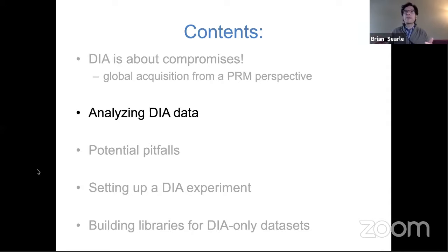And the reason why is because when you're co-fragmenting peptides in a small range, so for example, from 500 to 525, you only have to worry about peptides in that same range. Whereas if you're looking at a precursor scan, you're having to make the measurement of your 500 to 525 range, but also have those signals fight with other signals elsewhere in the precursor space. This is one of the reasons why BoxCar works fairly well, because it takes that precursor space and divvies it up into smaller segments where you can fill specifically for those smaller mass ranges.